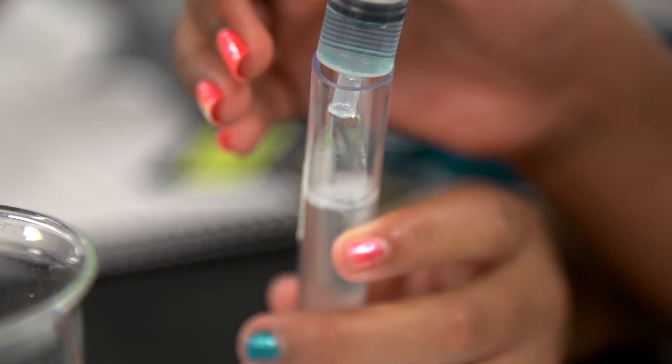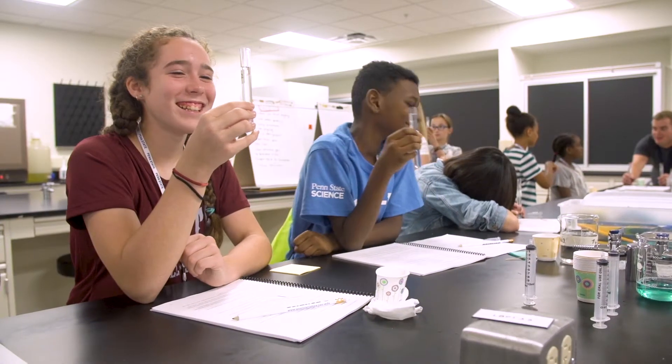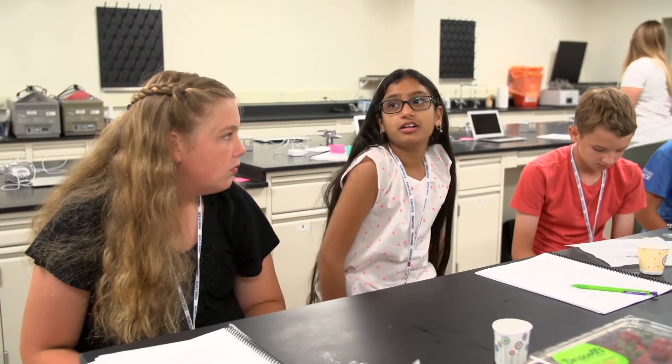The way we set up this DNA extraction is, for the first round, everybody does it step-by-step together, pausing to make sense of: why are we rinsing in saline and not water? Why are we using soap? What's the point of that? Why ethanol? To get kids thinking about the fact that these decisions we make aren't accidental, but they're not absolute — perhaps they could be modified. What is different if you use a different alcohol? Maybe we can investigate that. I want kids, on the first day, to realize that this is more about them and their discovery and their curiosity than it is about being right.